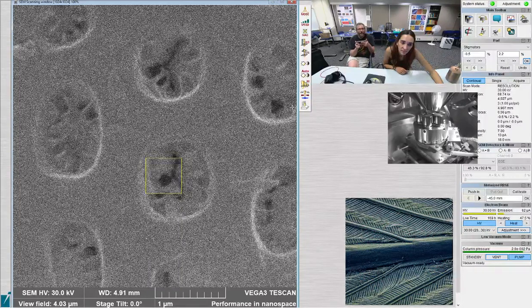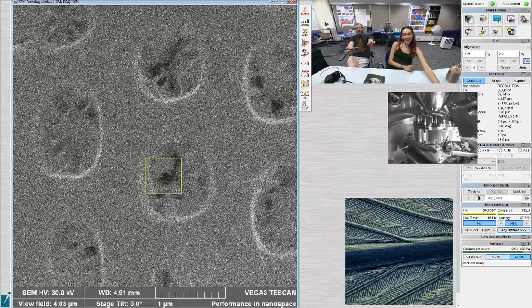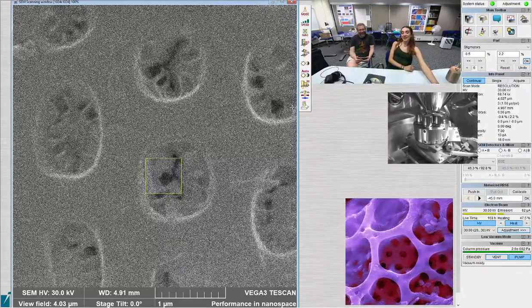There's a trick to stigmation, which is getting closer doesn't help. You actually kind of need to be a little farther back. Lean back a little bit, and then you'll be able to see the differences in the focus and the contrast a little bit better, because you're super zoomed in.